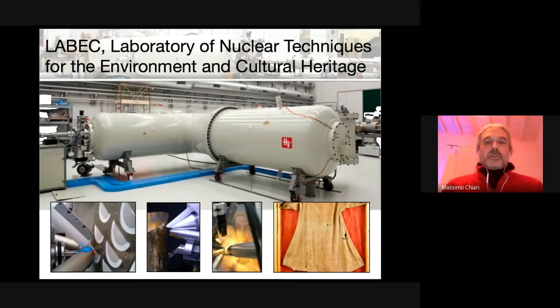Okay, our laboratory, I will start with a few pictures, is in Florence, in Italy. As the name says, we are mostly using ion beam analysis for environmental. Then I will maybe later detail that environmental for us is mainly air pollution and cultural heritage. You will see here some pictures about examples of analysis that have been done in our laboratory.